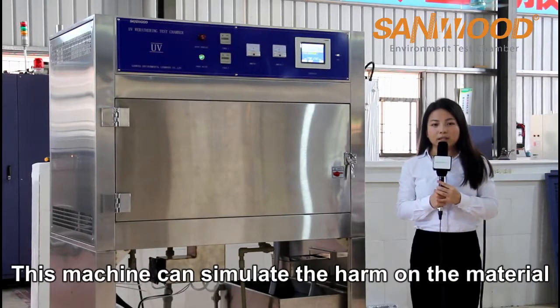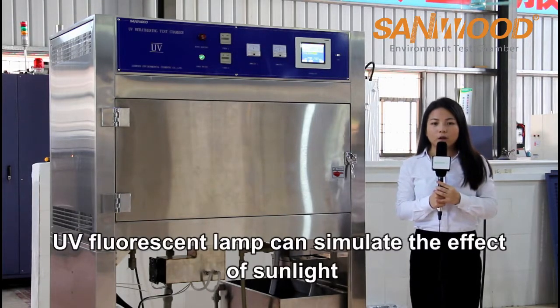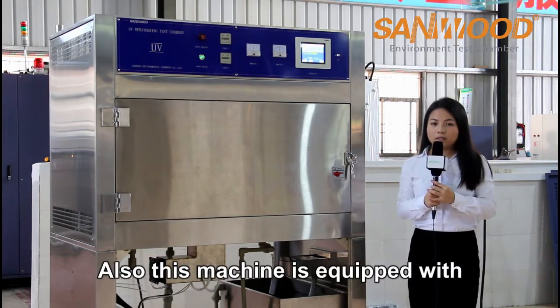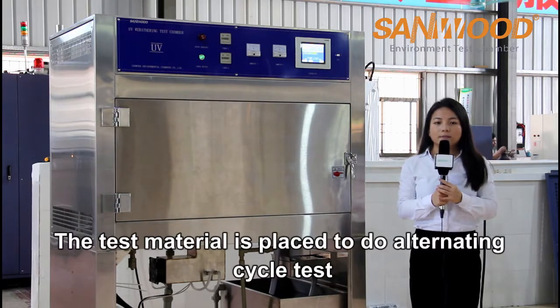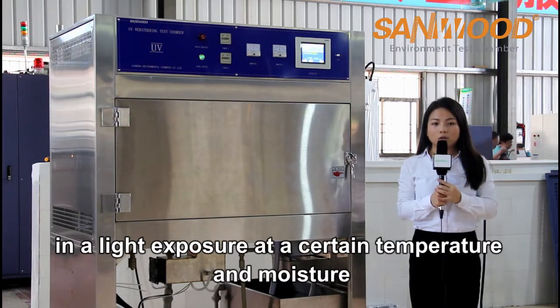This machine can simulate the harm to material caused by the sun, rain, and dew. UV fluorescent lamps can simulate the effect of sunlight. Also, this machine is equipped with a water spraying function and condensation function. The test material is placed to do an alternating cycle test in light exposure at a certain temperature and moisture.